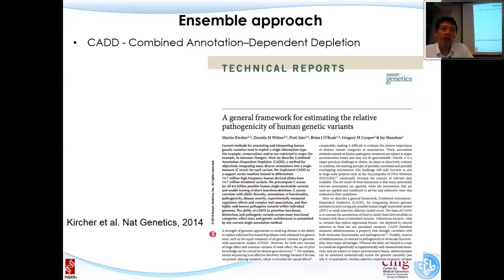There are a few tools published recently that focus on combining different tools together. So we have SIFT, we have PolyPhen, we have so many different algorithms that people can use, and none of them is a clear winner one way or the other. So what happens is people will try all of them and then use a machine learning based approach to give an overall ensemble based approach.